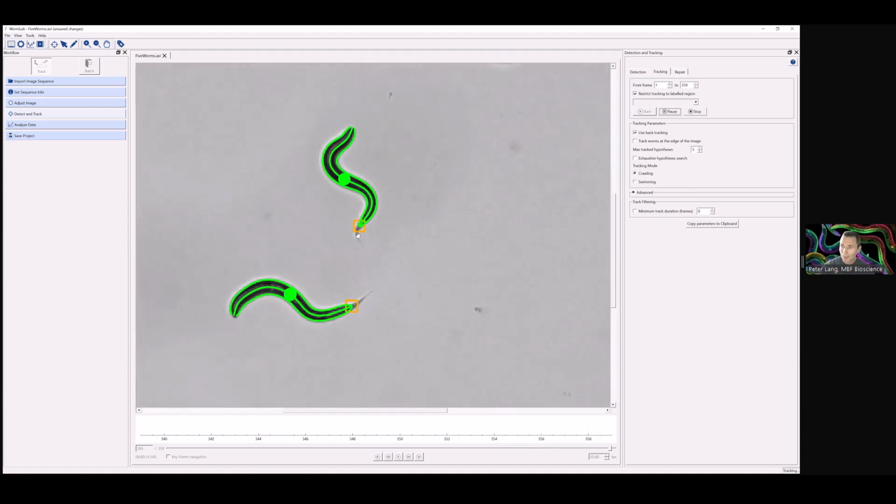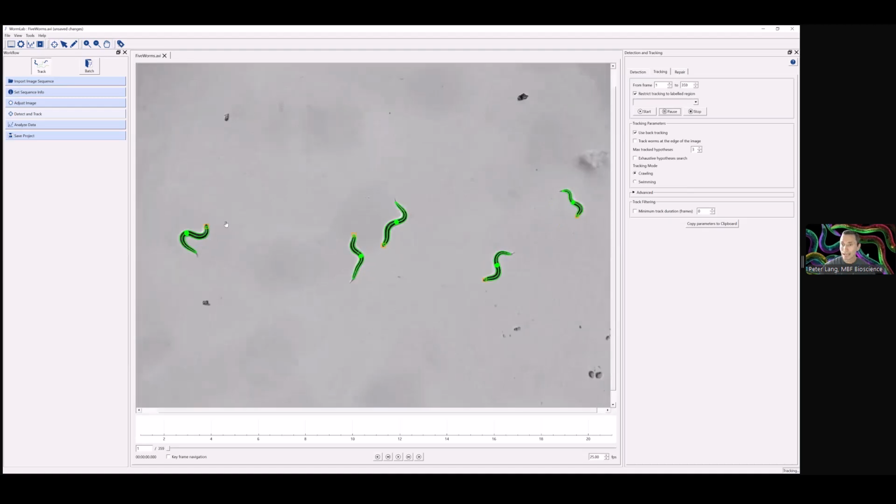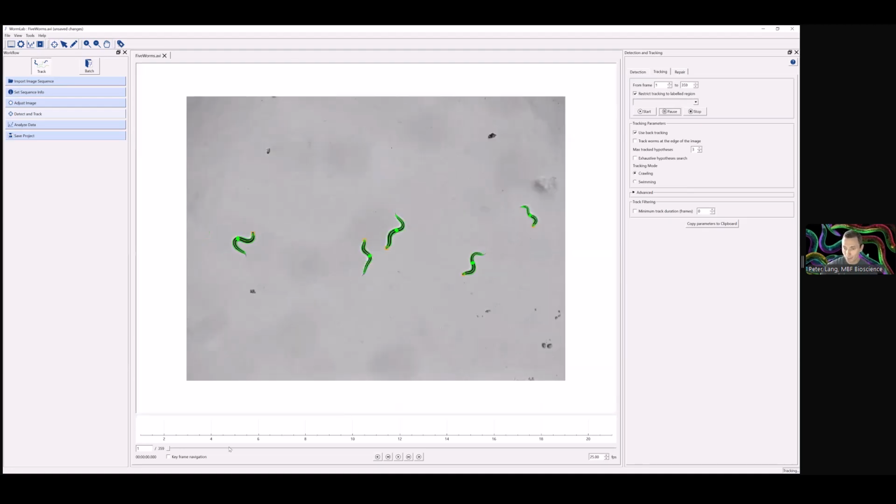No problem there. And upon completion of the tracking, you'll notice that we now have actually assigned our head and tail appropriately for the entirety of the video. We can scroll through it now and see that. Tracking through the entanglements.